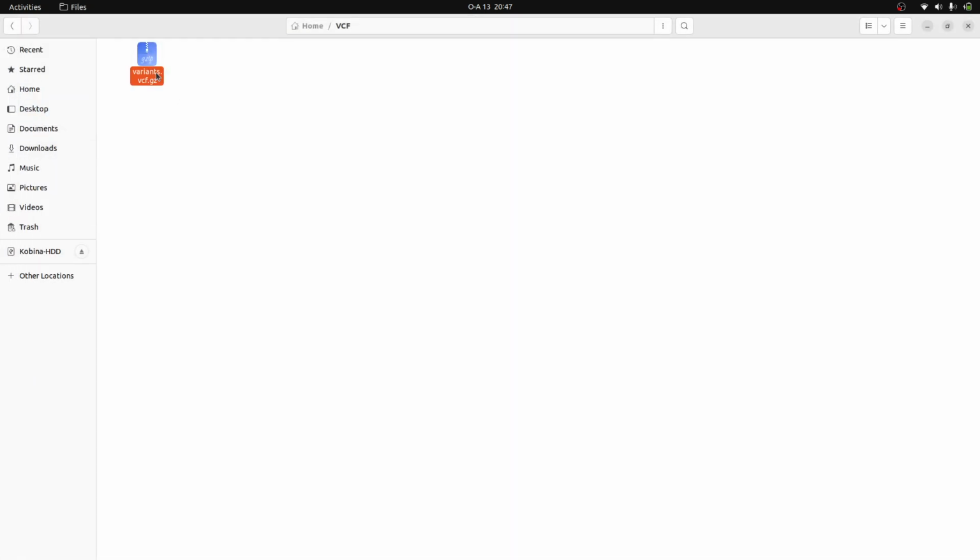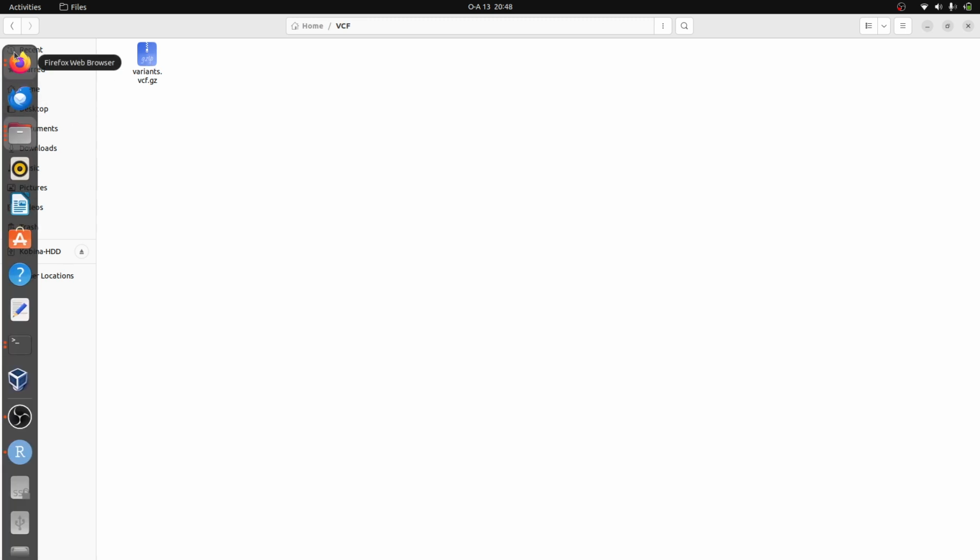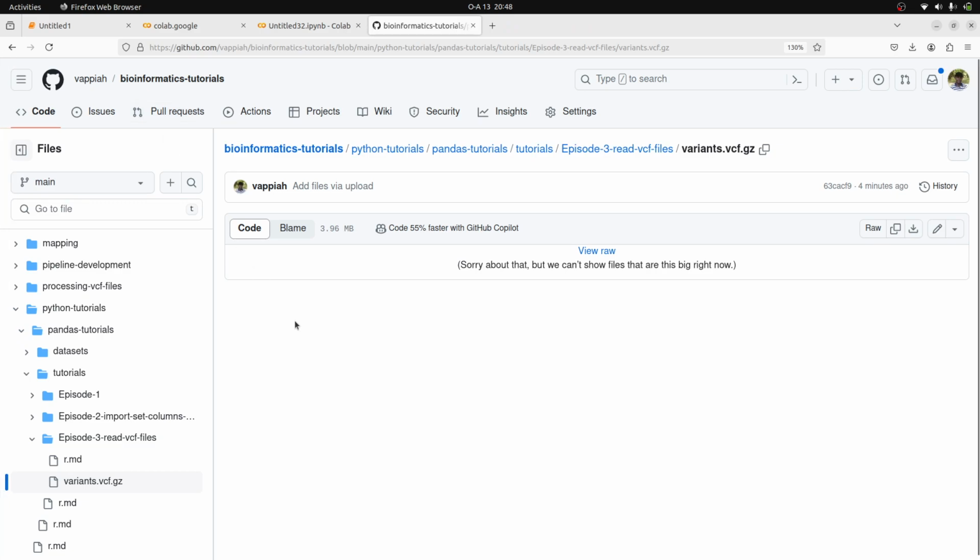So I will proceed to read it with Python. You can also read it directly from GitHub, which is fine too. If you have issues on your PC, you can still load it directly from GitHub. If you're using Google Colab, you just need to use the link. I'll show you all of that, so don't worry, we will go through it. You don't need to have it on your PC. I'll also show you another approach to read this file.